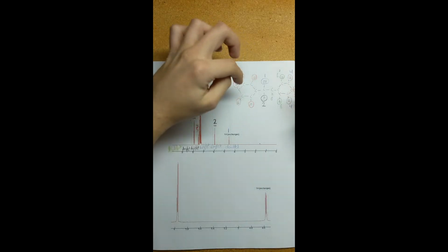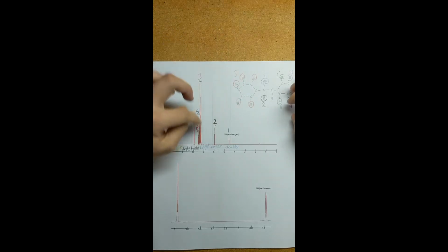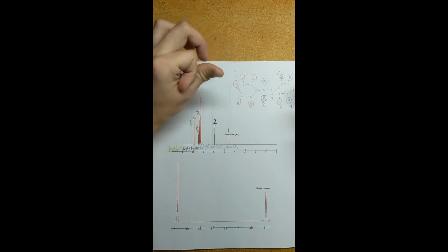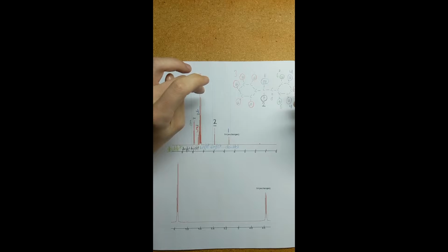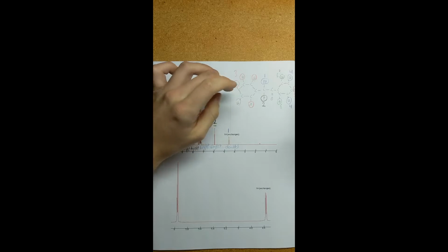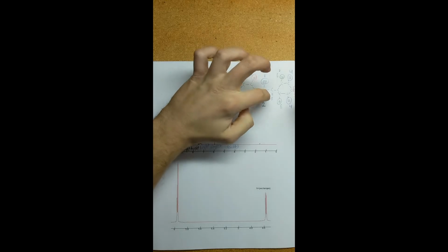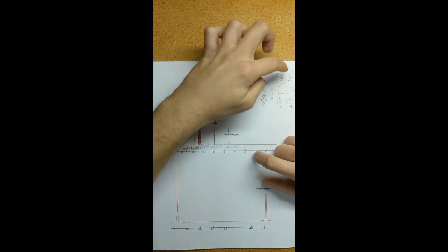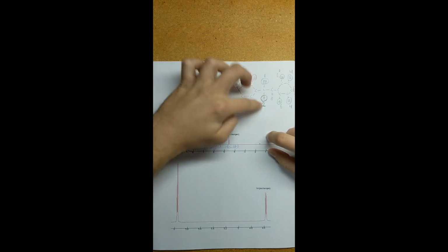To explain this further as to why all of these hydrogens are labeled here, again, this is an aromatic region and this is an aromatic structure. The integration here is 5H, and that's why there's 5 hydrogens or protons, and they are less deshielded than this aromatic region. The alcohol is very inconsistent as to when it is attached, whereas this double bonded oxygen is always there and is always pushing the hydrogens in this aromatic region farther downfield. So that is why these are here.